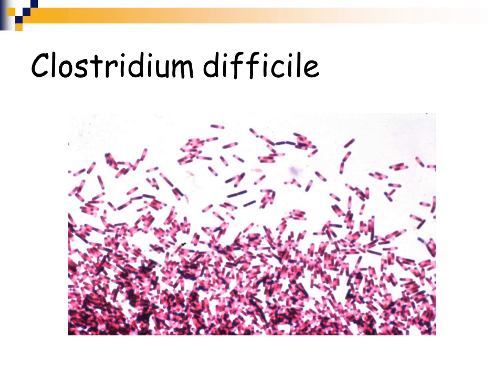Now, we already mentioned that the Clostridia organisms can sometimes over-decolorize. So you can see in this gram stain, this is a classic Clostridium gram stain, where there are portions of the cells that are staining a nice dark purple, but then there are portions of the bacterial cell that are staining more of a pink. So it is gram-positive, but it can be over-decolorized. And you could see that clear area inside the bacillus is the spore.